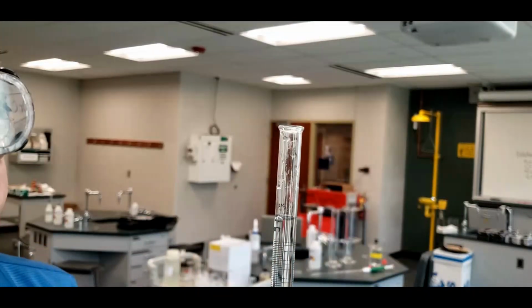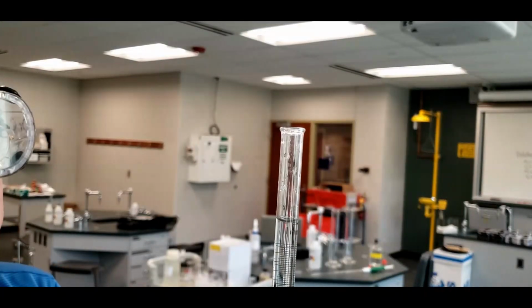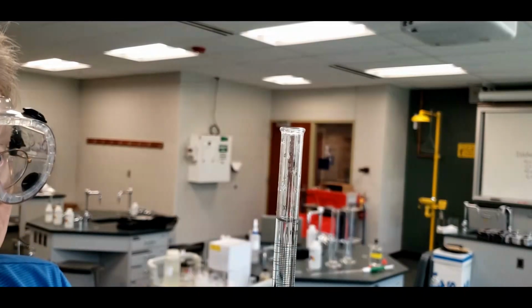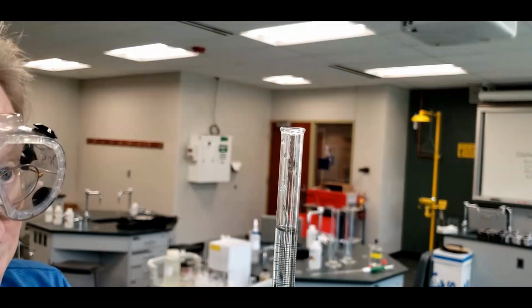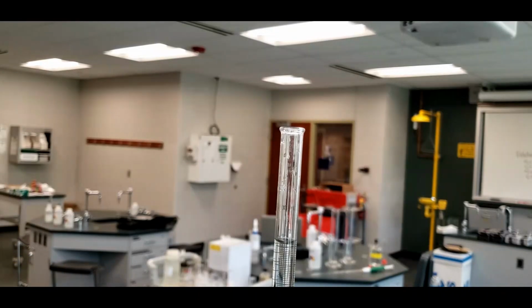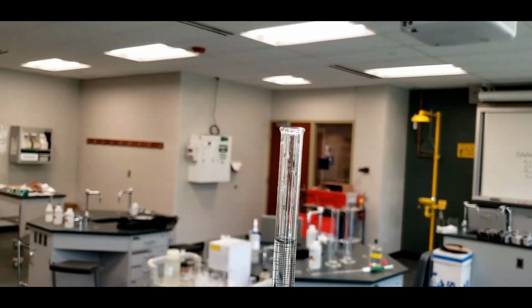This out of the way. And I'll show how you use the valve here at the bottom, but you can see that the 0 is here and the water level is here, but you'll just open up the valve slowly and let the water run into a waste container, and the level should go right to 0. So you don't want to use a pipette to try to draw the solution back out. You can just run it through into a waste beaker.